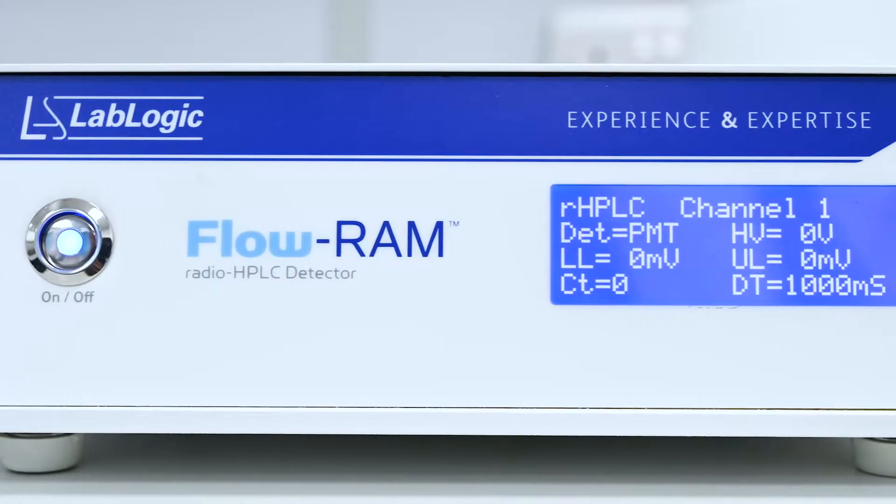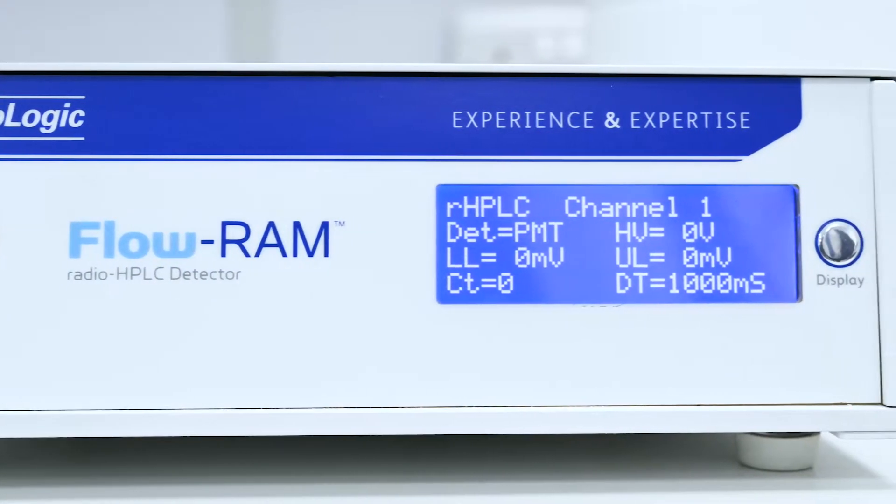Hi, I'm George, nuclear medicine and PET product specialist here at LabLogic. Today we're going to take a look at the Flow-RAM, which is LabLogic's solution for PET and SPECT radio HPLC applications.